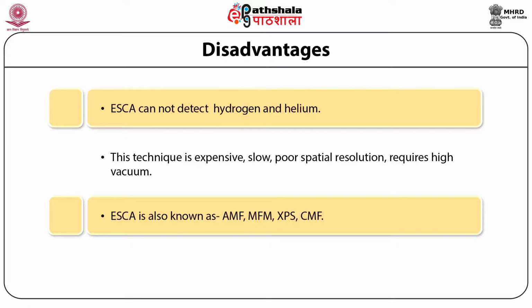Then one other very serious disadvantage of this technique is that it requires very high vacuum. And if by chance the vacuum leaks, if there's a leakage in the vacuum, you will never be able to get the right result from this technique. So one needs to maintain it very well in order to continuously use this. Therefore, one cannot say that it has all the advantages. It has many disadvantages also, and this requires a very high degree of maintenance if one has to continuously use this technique.